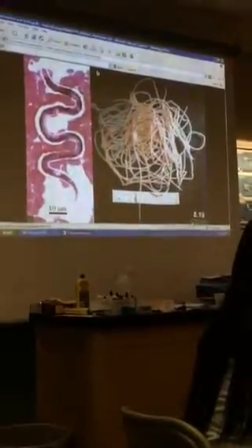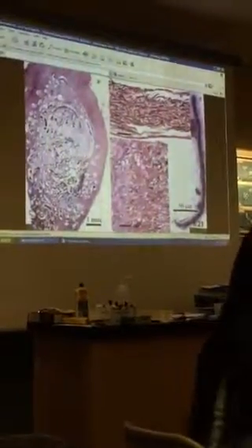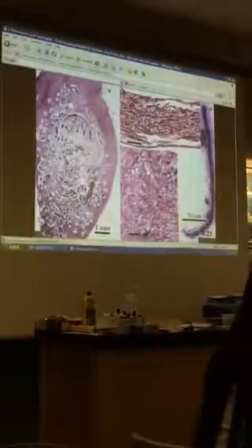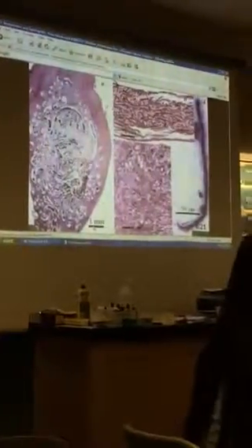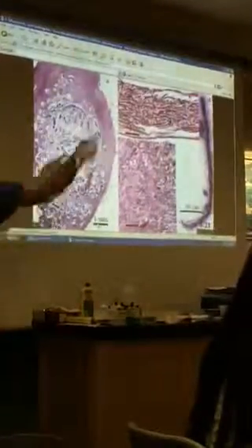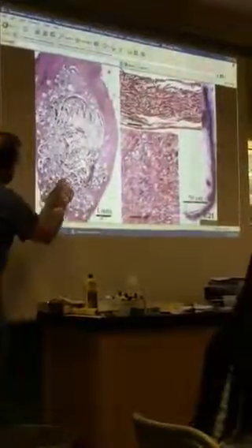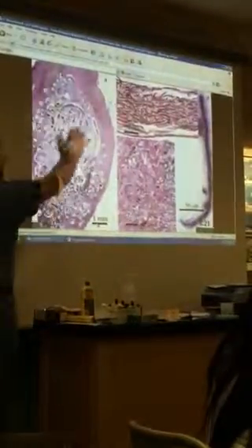A relative of this that's also a filarial nematode and an important parasite of humans is Onchocerca volvulus. This causes river blindness. The adults are in pretty large nodules under the skin. What you're going to see is a section through one of these nodules, kind of like the Ascaris dissection. You've got fairly long adult worms in there that are chopped in half in various places, like spaghetti cut in half. You may even see a couple of uteri. You can see the uteri pretty nicely on these females. I'm not going to make you recognize that, but that's what you're looking at.